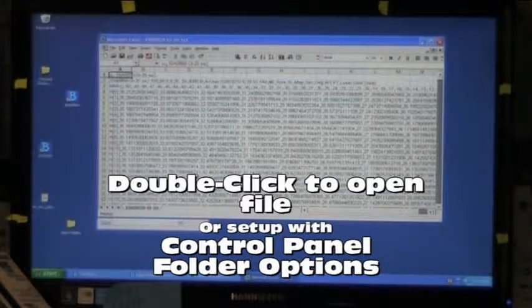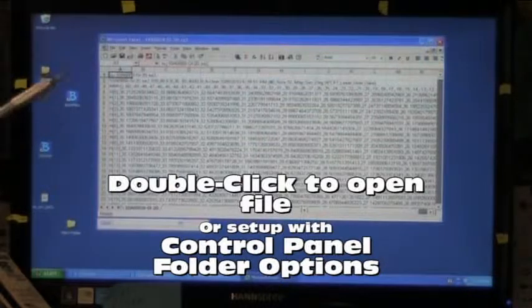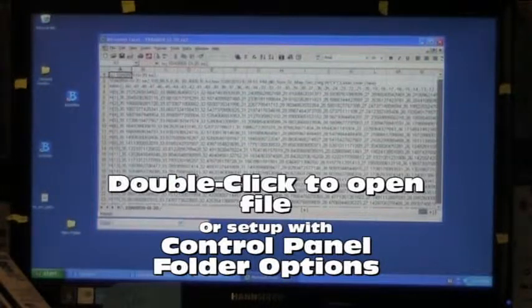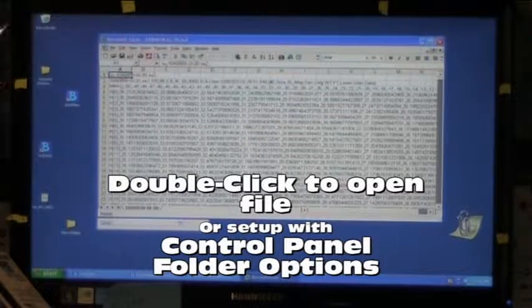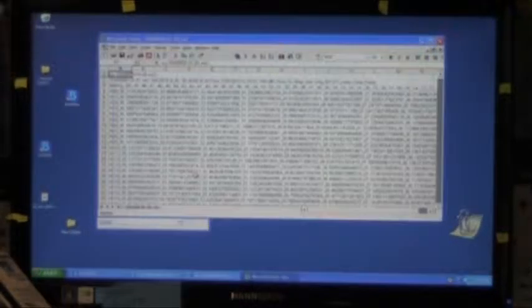Another way to set up file association is with the control panel folder options. Different versions of Windows have different procedures.